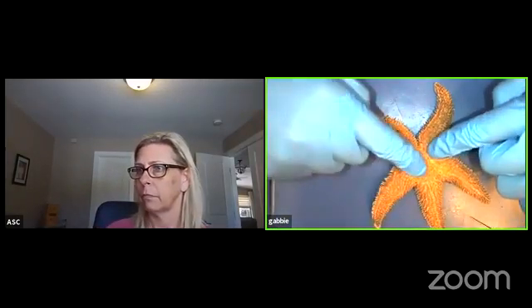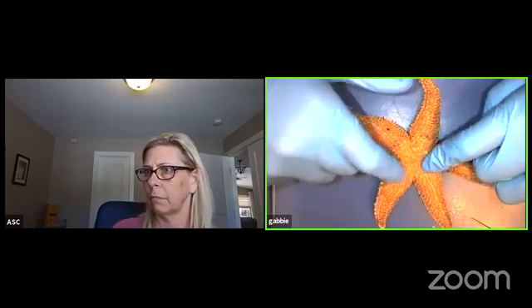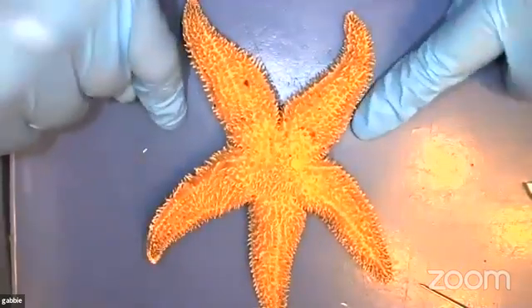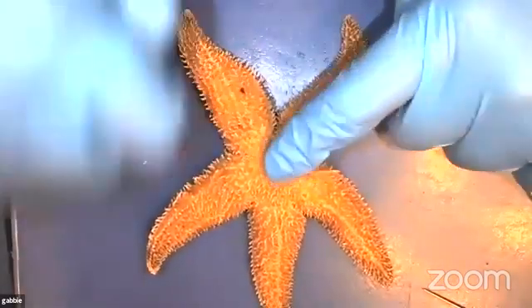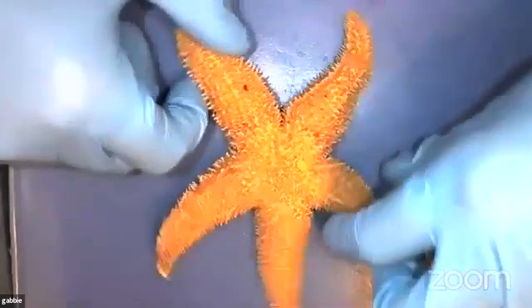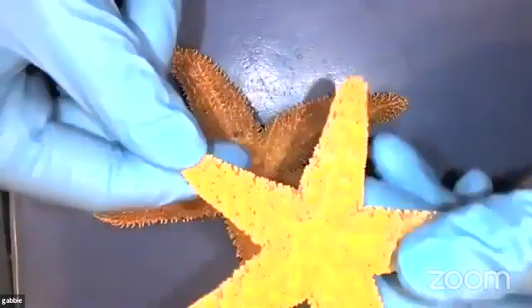So a sea star is actually an echinoderm. That's a name that means spiky skin. As you can see, it has all of these little nodules on top of the skin that make the sea star spiky and help protect it from predators. They have something called radial symmetry, which means they're symmetrical from the middle in the directions going outside. They're found in the sea, and there's 6,000 species in this group of echinoderms, but this here is a sea star, most common. So sometimes you might find something like this on the beach, or maybe you buy this at a shop in, like, California or something.